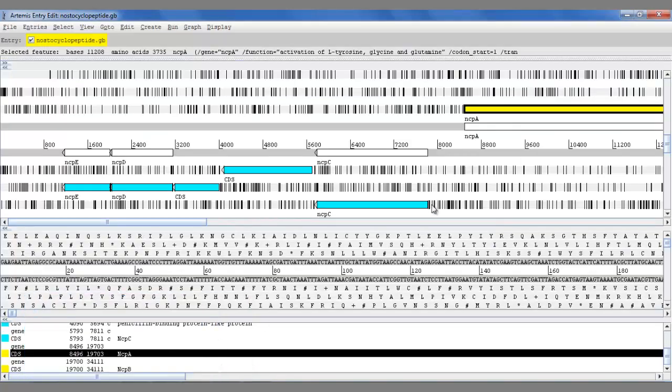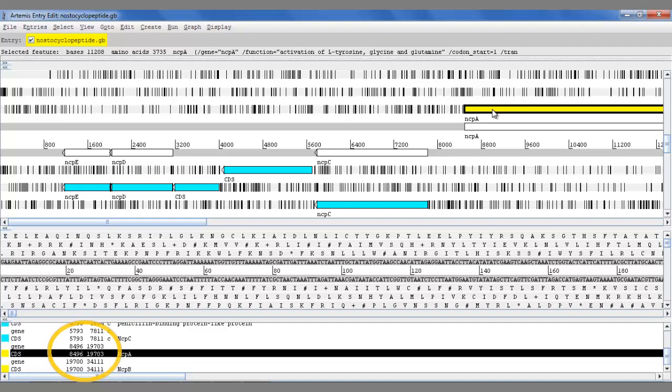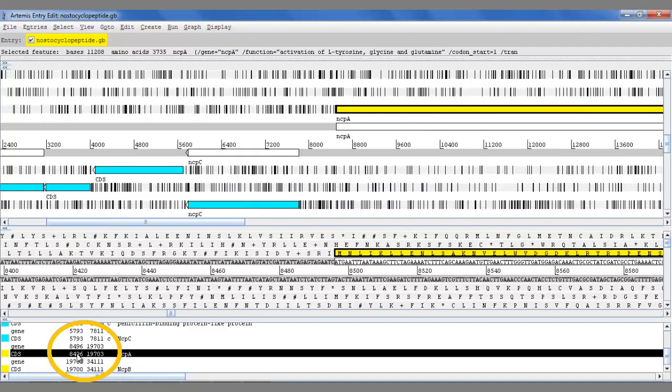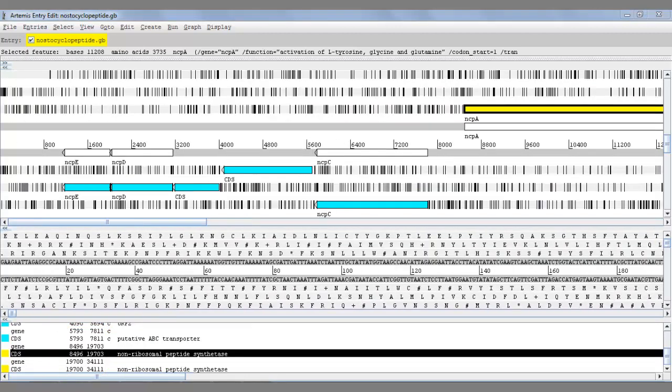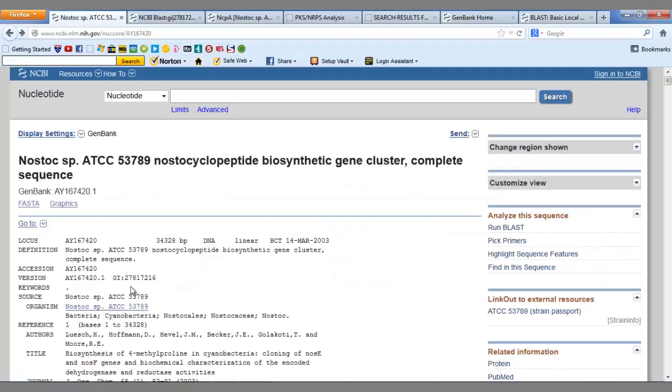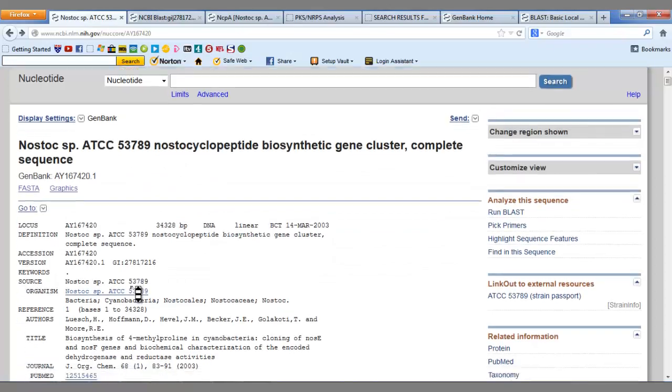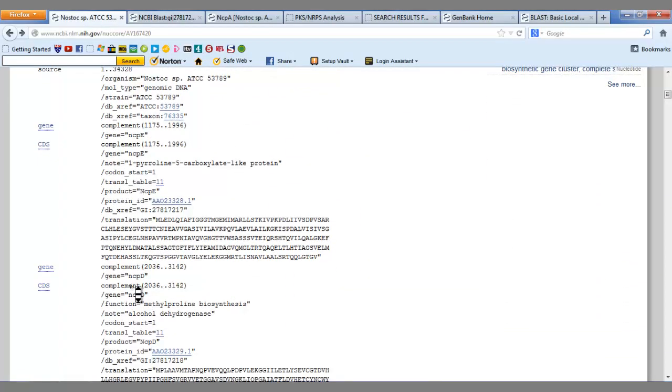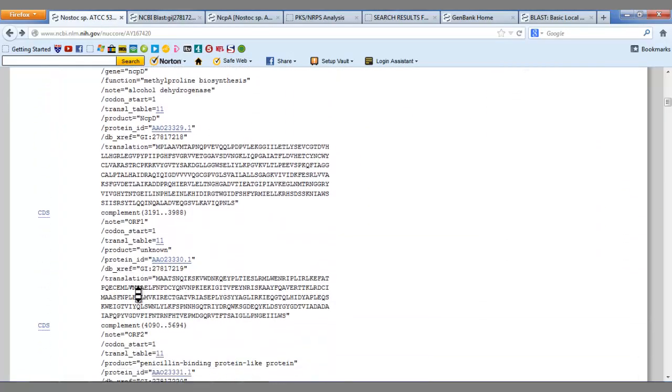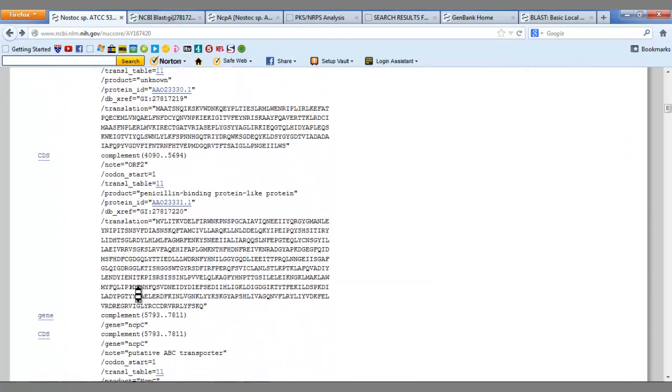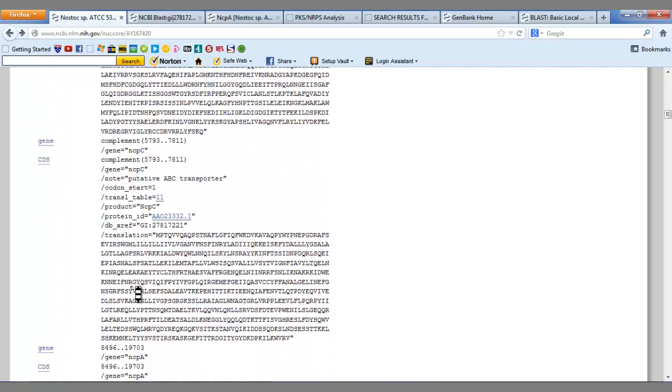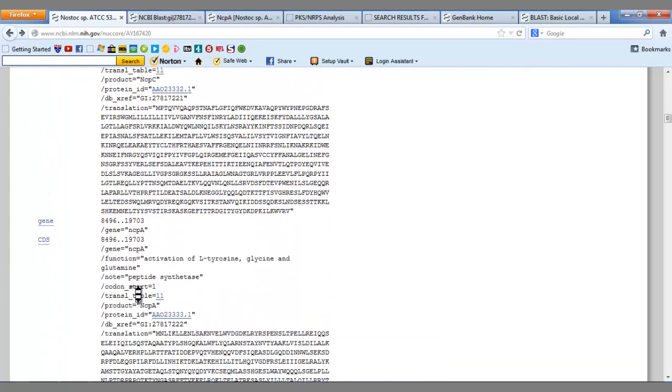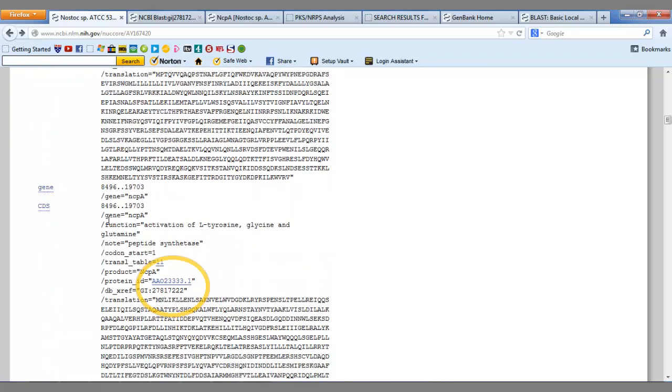We click on this region and we can see that it begins at base pair 8496 and ends at base pair 19703. So we can go back into GenBank and locate this region on the sequence. Once we have found the region, we can click on Protein ID and this opens up another page which is specific to the region highlighted on Artemis.